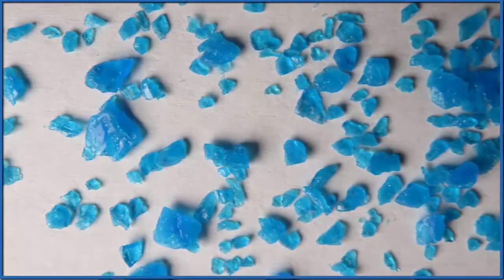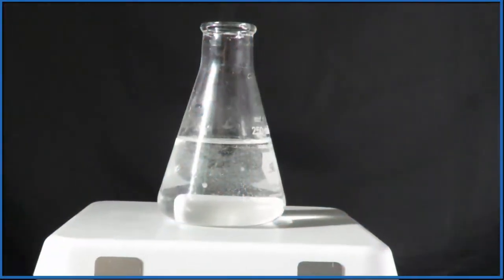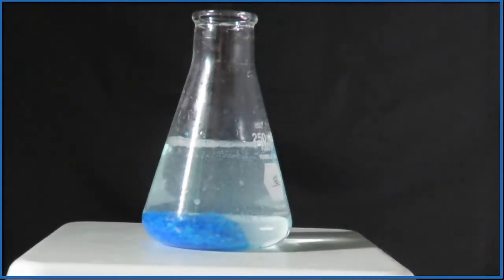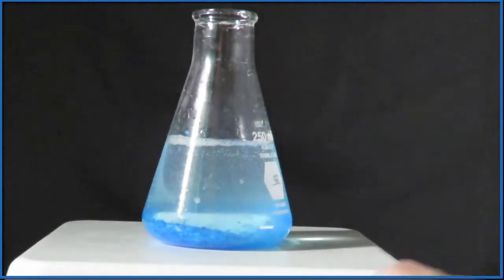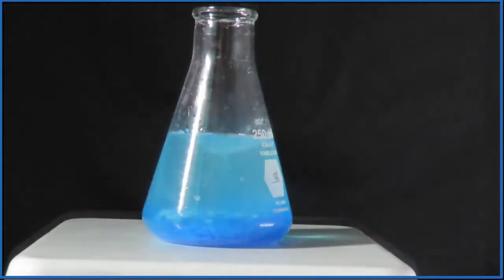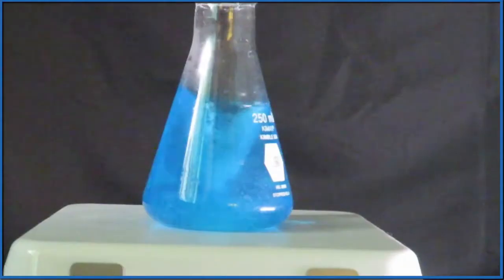Typically when we have copper sulfate crystals, they're going to be a blue crystal, as you see in the picture here. It's pretty soluble — you put it in water, this is a magnetic stirrer, we turn the stirrer on, and you see that it dissolves and it creates this blue solution. So a solution of copper sulfate is going to be blue.